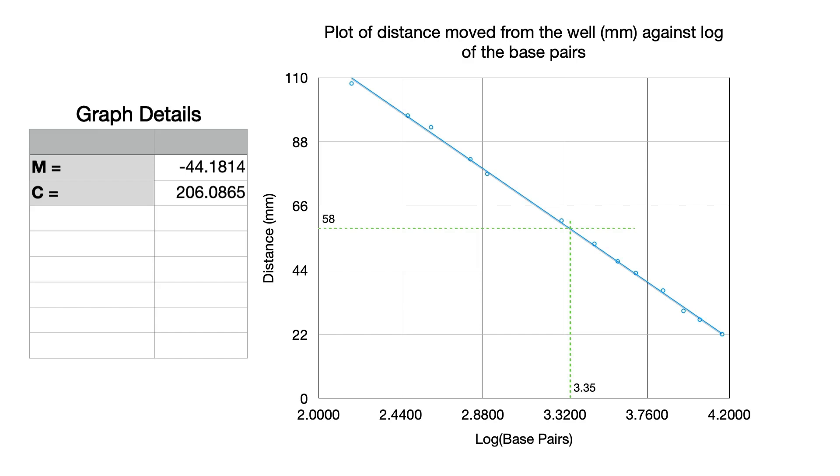Now initially you might think hang on there's something wrong here, it appears to be intercepting around about 110 or 120 somewhere in that region. But don't forget the bottom axis there, the x-axis, is starting at 2 so we're not seeing it over at zero, so don't get alarmed by that.